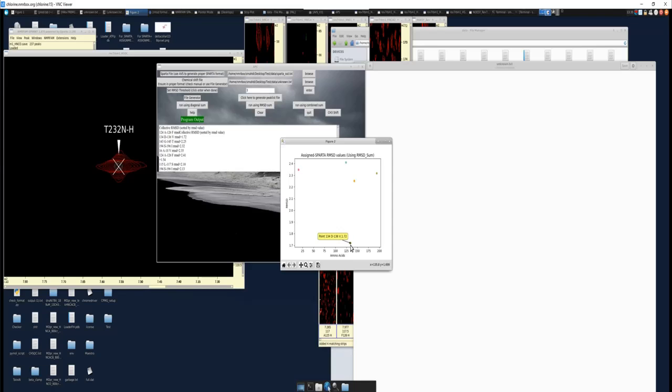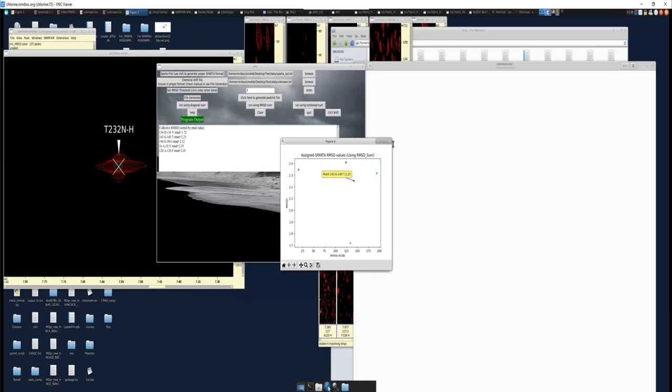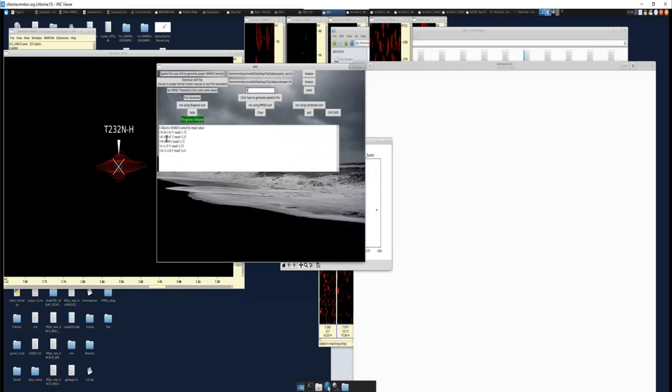And now what we'll see, let me clear the previous stuff, is that that alanine-alanine match has completely come up here now to 2.41. And now this is saying the best fit is this aspartic acid to this valine. We know that's not true. We know that it should be an alanine-alanine pair, right?